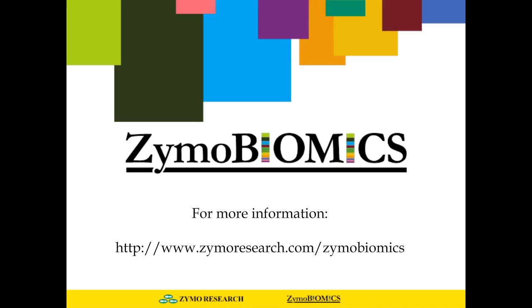How can you assess whether these methods are, in quotes, unbiased? The gold standard has been highly debated. Unbiased is used a little loosely here. It's only unbiased relative to our standard. But our standard is including many organisms of differential hardiness, etc. It's the closest that we can get to unbiased without including, say, another 100 organisms or 1,000 organisms. So that's our philosophy on it, is that we're moving towards as close to unbiased as we possibly can, but you're absolutely correct. There's no guarantee it's absolutely unbiased in all contexts 100% of the time. And everything's based upon the standard, so that's our criteria.